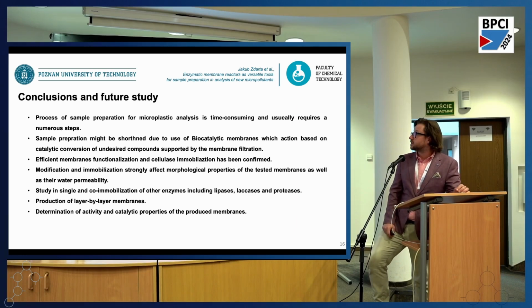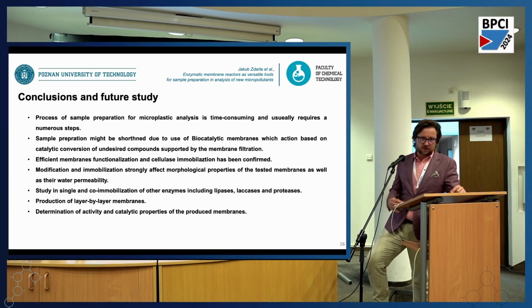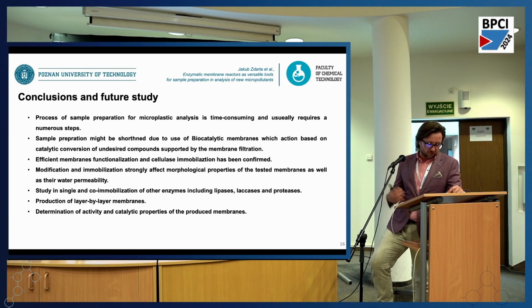Nevertheless, in conclusion, the process of sample preparation for microplastic analysis is time consuming and requires numerous steps. So we need to shorten this process and reduce its cost. Sample preparation might be shortened by the use of biocatalytic membranes, in which the catalytic conversion of undesired compounds is supported by membrane filtration, and efficient membrane functionalization and cellulase immobilization has been confirmed in our study.